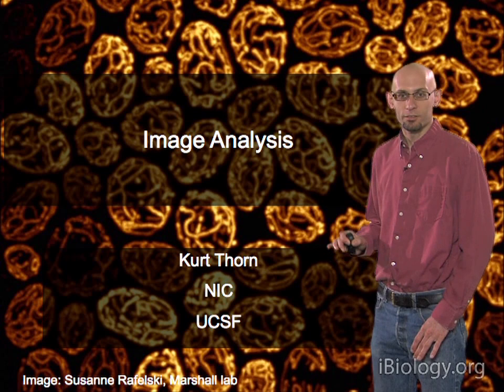And if you use deconvolution, you take advantage of that redundancy in a sort of mathematically correct way to try and reconstruct a more accurate image by using that redundancy to infer what the underlying data that gave rise to your image was. But even if you're not doing deconvolution, you can exploit some of that redundancy by smoothing with a Gaussian kernel that's sort of the same size as your point spread function.